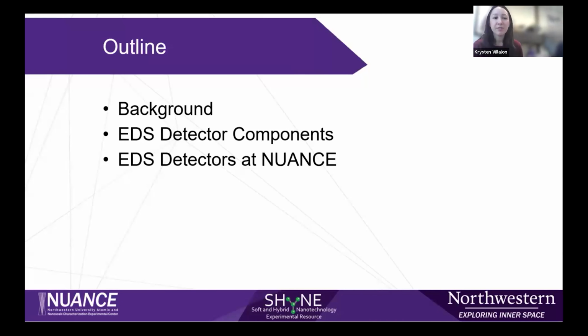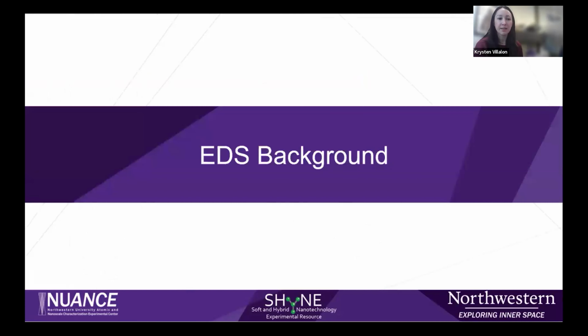And we'll also start off with a little bit of background for anyone who is unfamiliar with what EDS is and how it works. And then we'll get into talking about the EDS detector components, what they all are and what they do. And then we'll talk a little bit about the EDS detectors that we actually have equipped on some of our SEMs here at Nuance. So let's get into just some of the basic background.